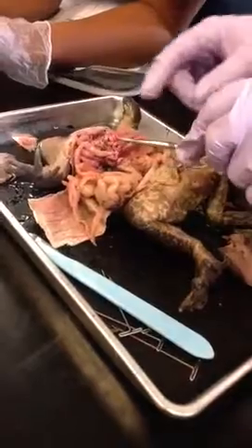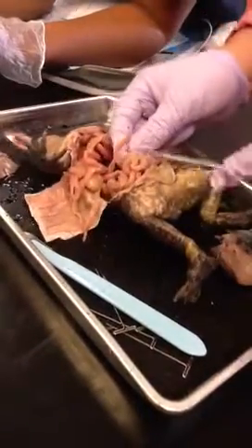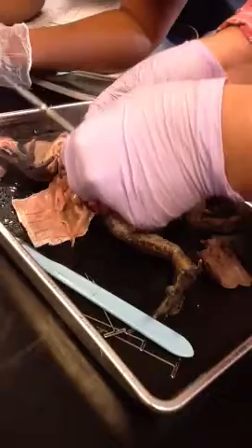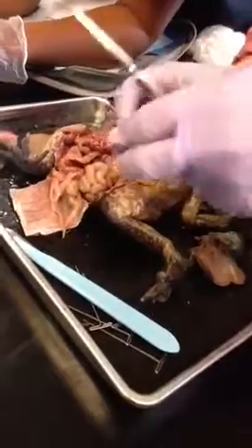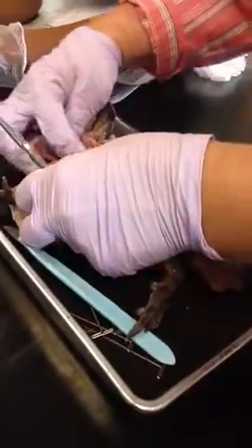Okay, now this tube is different from these tubes. These tubes here, these are the oviducts. Yeah, I was like, okay. Those are all the oviducts. Because if you follow that small intestine, it coils around much smaller than those oviducts, and those are quite large. She had a lot of eggs. She had tons. It was ridiculous.